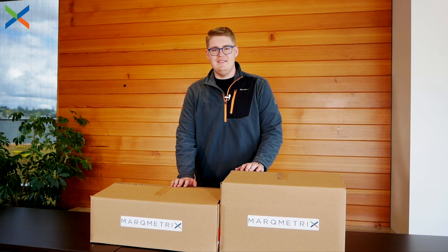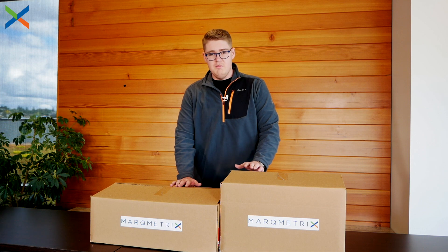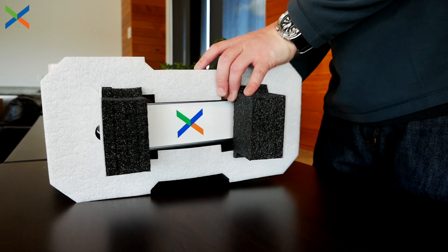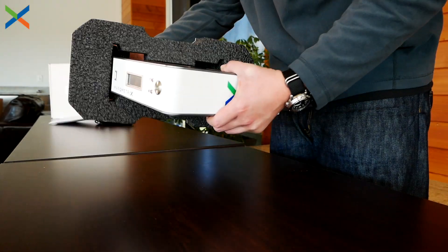Hi, I'm Mike with Markmetrics and today we're going to go through the complete out-of-box experience for the Markmetrics all-in-one Raman system. This is going to include unboxing, initial setup, and then we're going to go ahead and test the product to make sure it works.